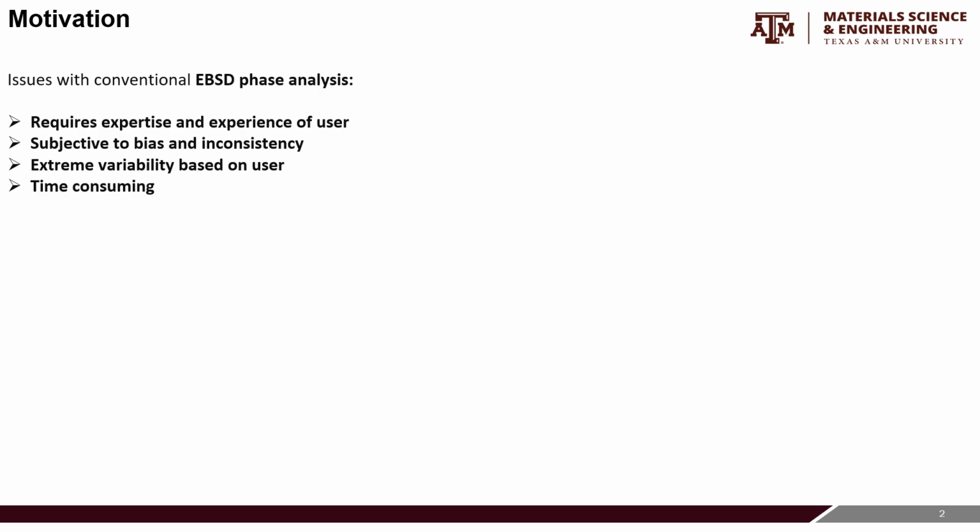To begin, the motivation behind this paper is to eliminate the need for human labor in EBSD post-processing analysis for phase identification. The issue with conventional EBSD phase analysis is that it is extremely subjective to the user. There is bias, inconsistency, and variability between users, and it is extremely time consuming.